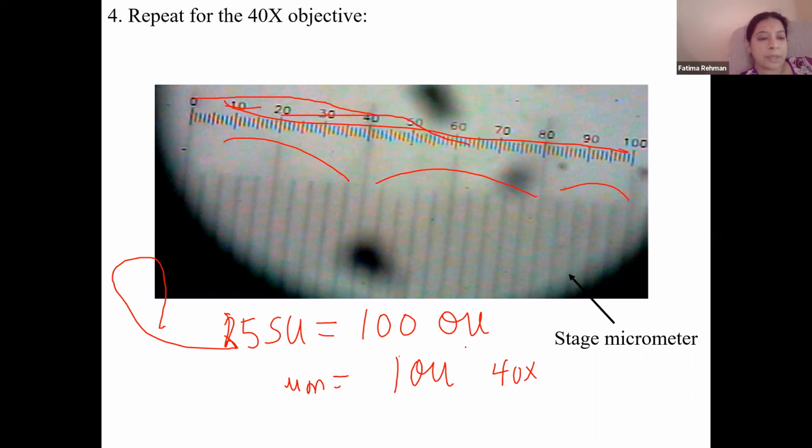So what would be the calibration? So it should be 250, right?